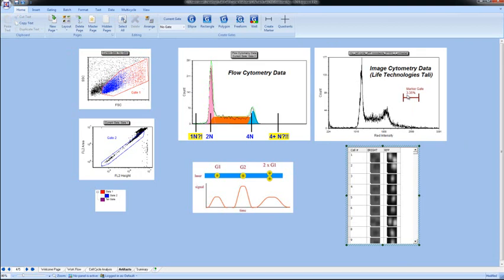Now, one typical type of artifact that can occur with segmentation is you can see this first cell in our analysis, or this first segmentation. In this segmentation, there's actually 2 cells included, and that also happened here down with cell number 7, as you can see. Now, what we want to do is remove those cells from our analysis, because if we count 2 cells that fall within the same segmented area at the same time, you're going to have a similar artifact as cells clumping together with flow cytometry data.